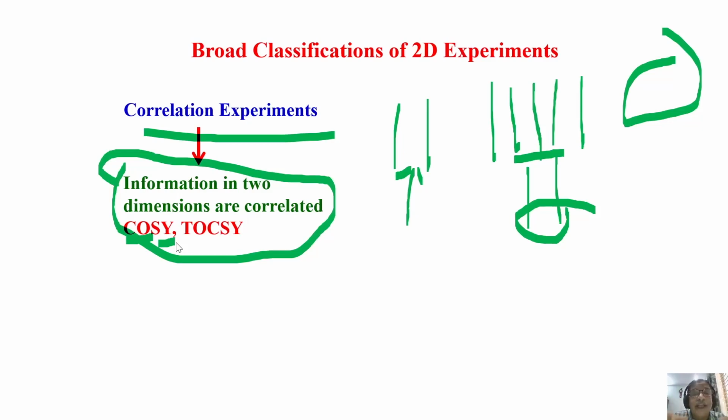So this type of coupling information, where the 2 protons are scalar coupled, mediated by a covalent bond, can be correlated. We can correlate 2 protons which are coupled to each other, or more, including long range coupling. If one proton is experiencing many couplings, all of them can be understood, which is coupled to which.